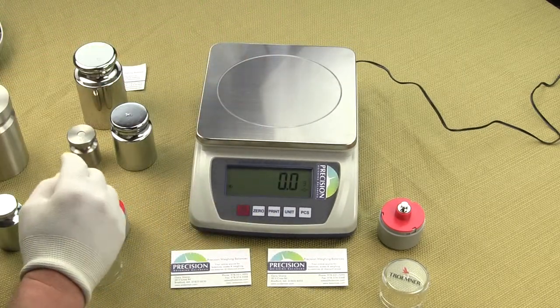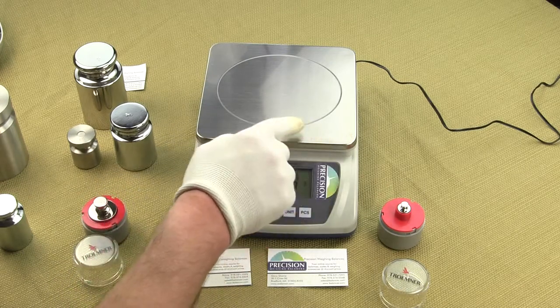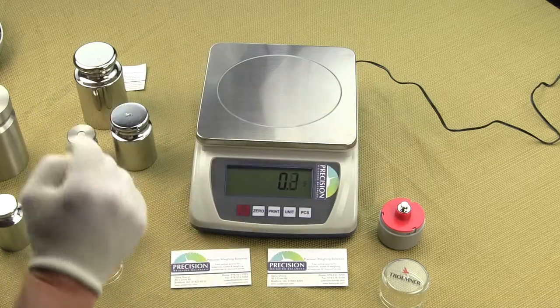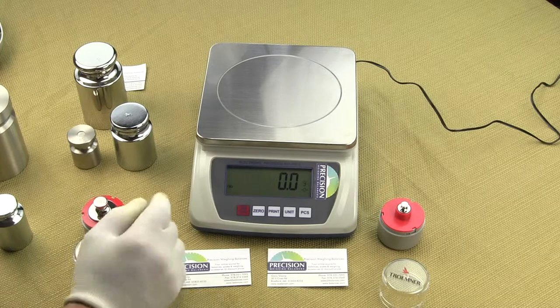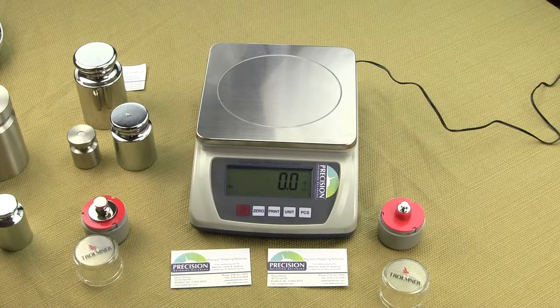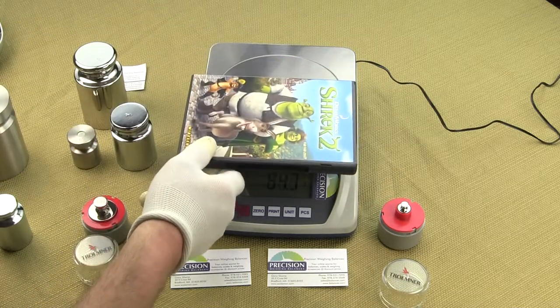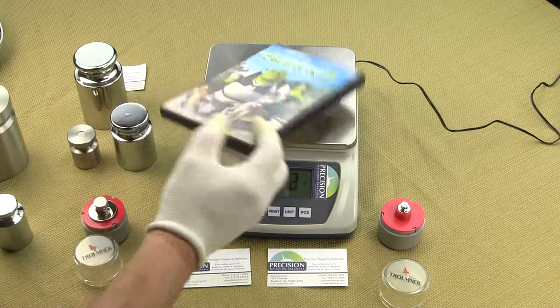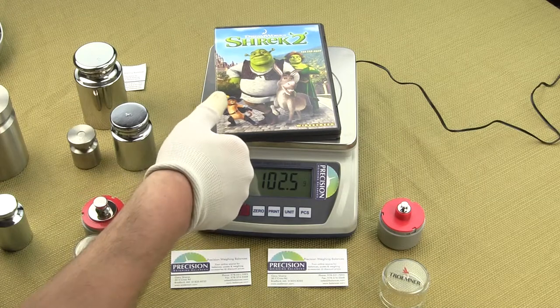The large weighing platform measures 6.7 by 7 inches and can accommodate most large samples without covering the LCD display. Sometimes people put large objects on the platform and they would cover the display, but as you can see in this video, it can easily fit on the platform and you're still able to see the weighing results.